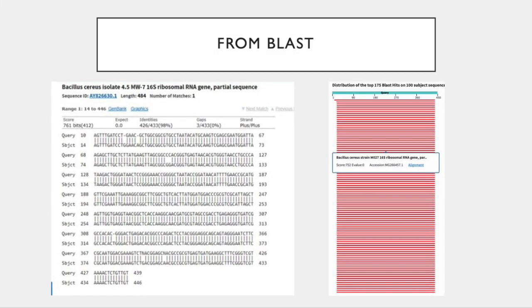From the evidence provided by colony morphology, biochemical testing, and BLAST software, we've concluded that our unknown bacteria number 14 must be Bacillus cereus. According to the BLAST test, our query coverage, or the percentage that our sample aligns with the reference sample, was 95%. We can also look at e-values for more evidence to support this claim. A low e-value is the best indicator that our result was not by chance, and our outcome for this BLAST test was a value of 0. Lastly, from the BLAST test, our percent identity was 98.38%. The higher the percent identity, the more likely the match is significant and not due to chance.